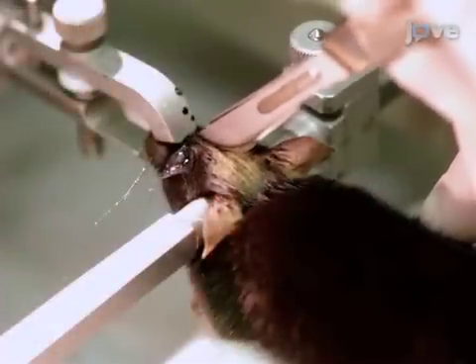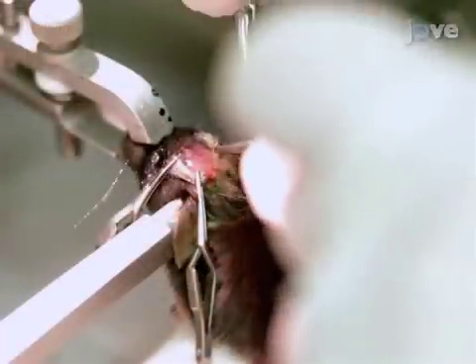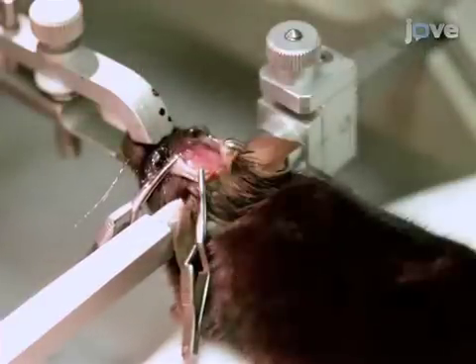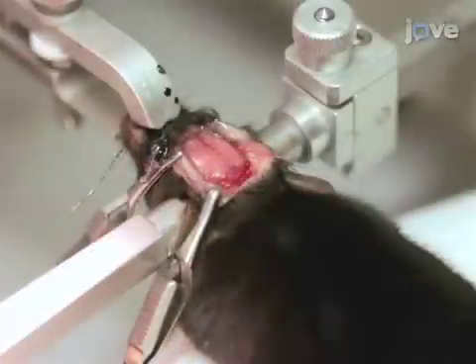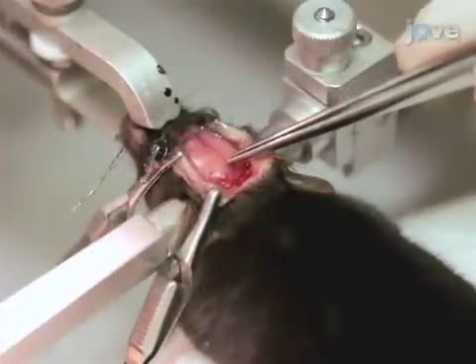Next, using a scalpel, cut open the scalp to just behind the ears. Place bulldog clips on the corners of the scalp to peel away the skin from the skull, making sure bregma and lambda are easily visible. Ensure that the suture from bregma to lambda is aligned, and reposition the head if necessary.